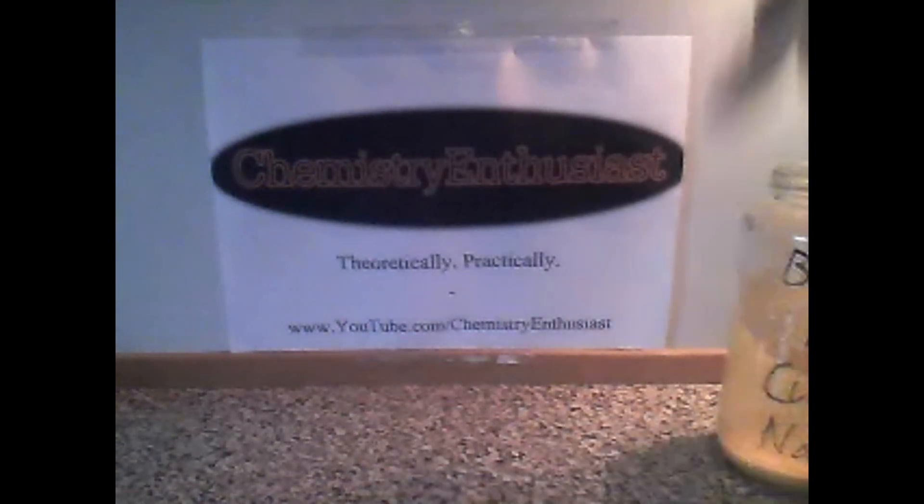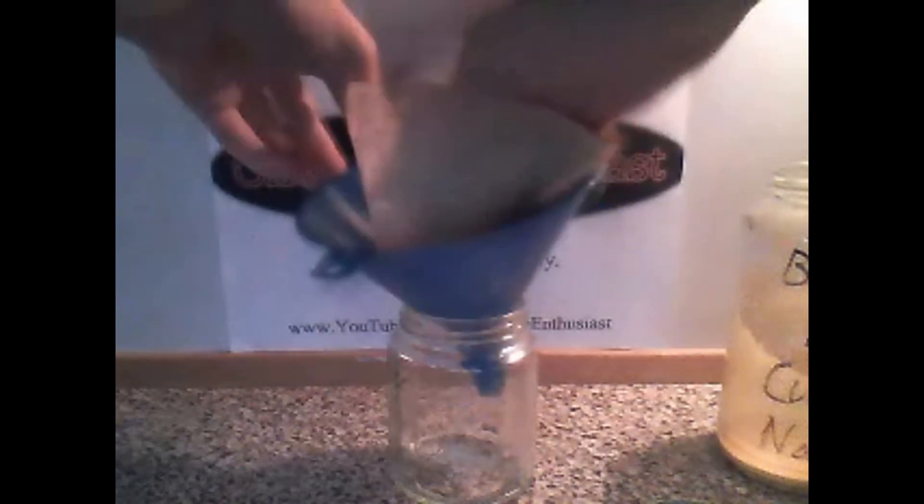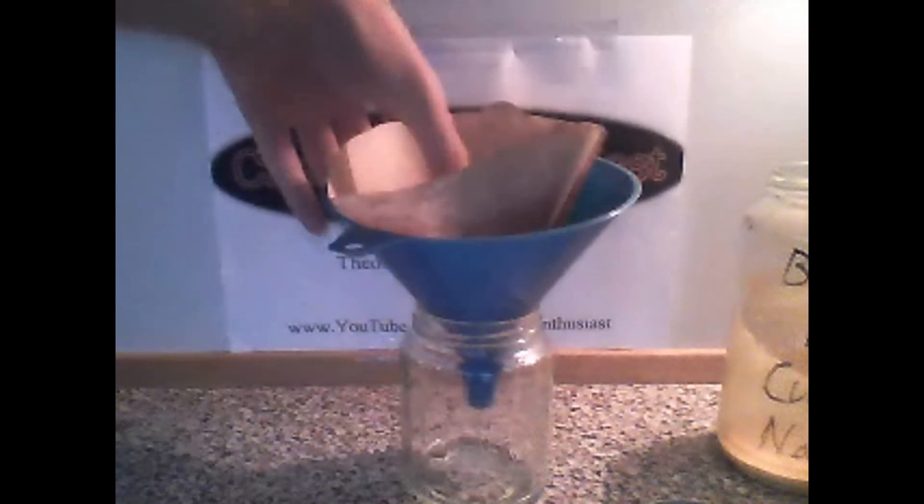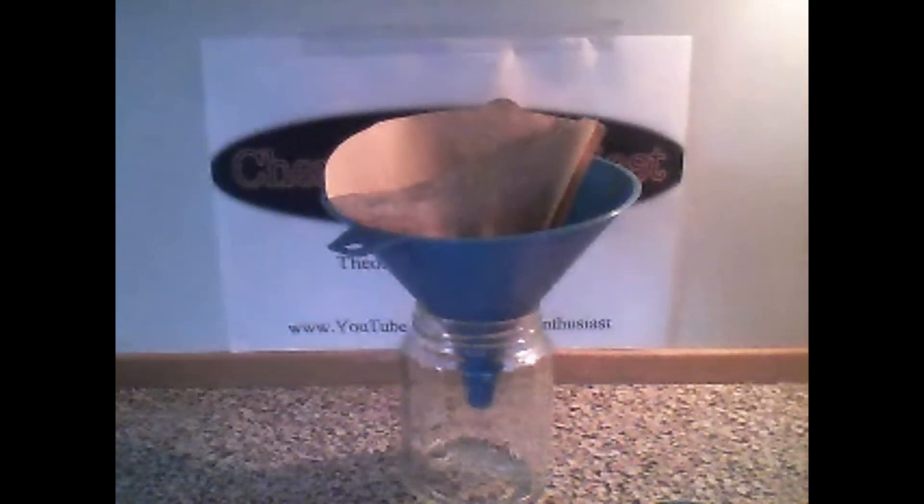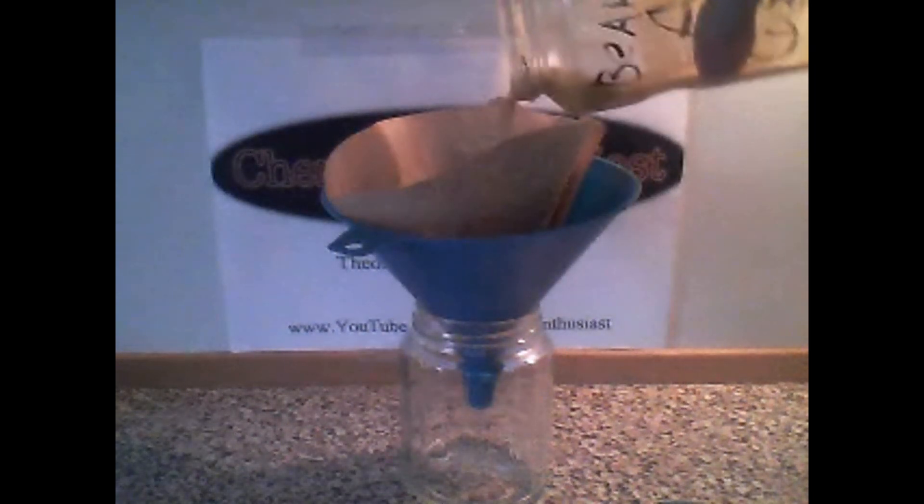Now you can decant off the water again, as I have done here. And you take a funnel and put it into a beaker, and fold a coffee filter so that there are no gaps open at the bottom and the side. Now put the coffee filter into the funnel.